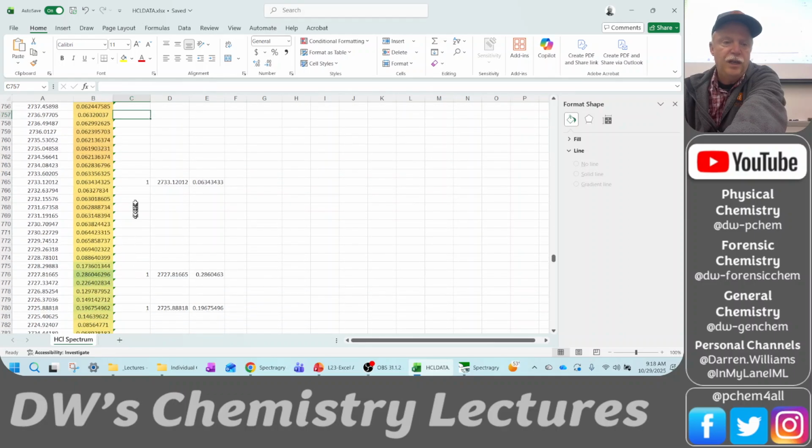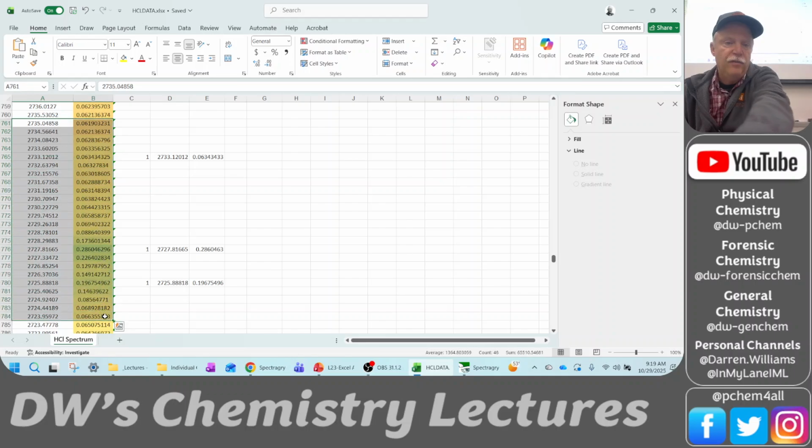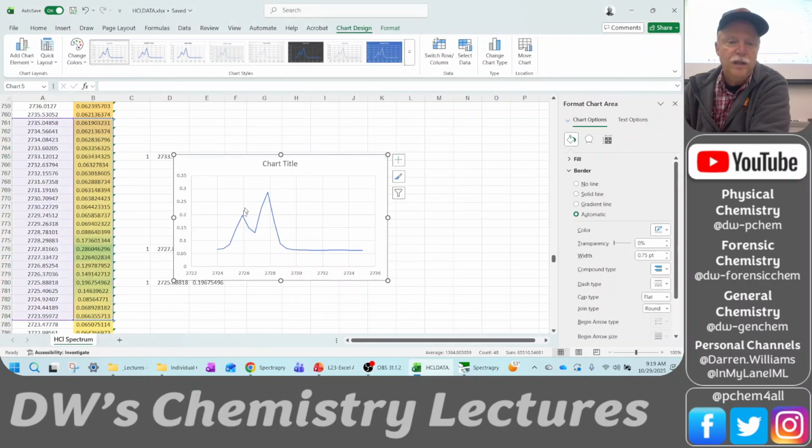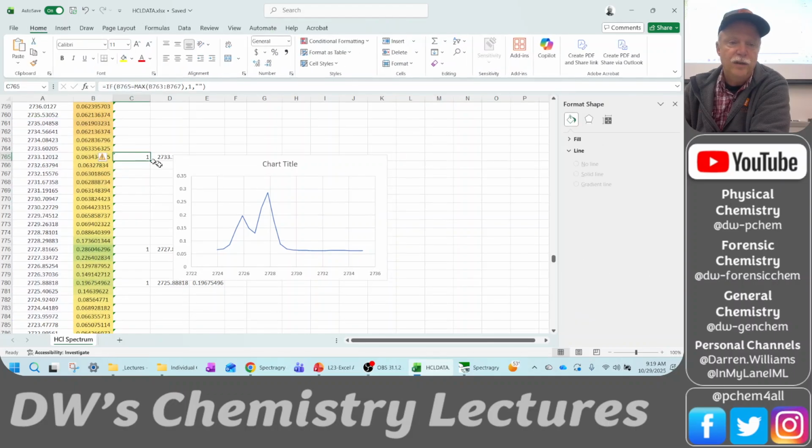And if you wanted to check, you can always plot it. Let's just check to show you again, if I wanted to check if this one's real, we can come here and quickly look at the plot. See, I've got 2 peaks here. That's the 0.28 right here. This one is close to 0.2, so 0.196. And so then this guy up here is noise. It's this little barely hump.